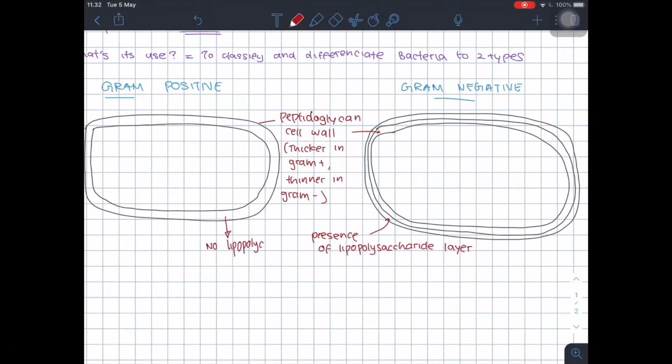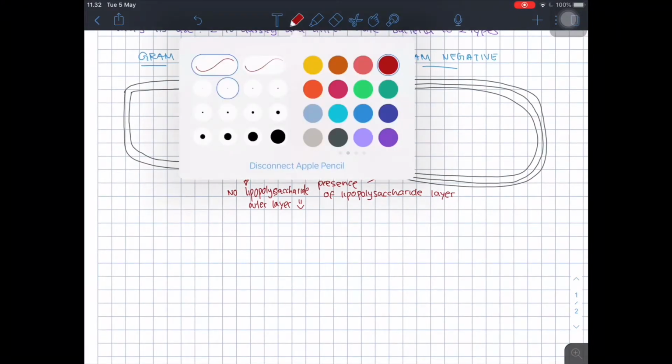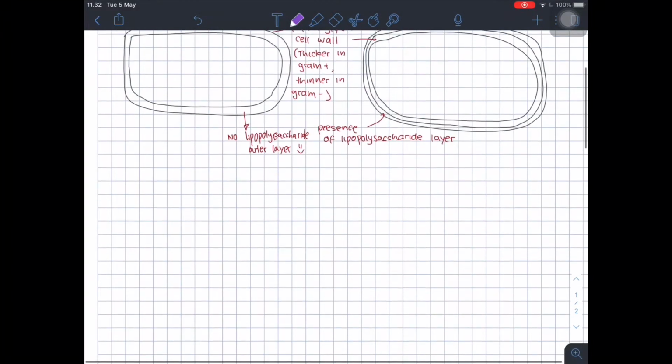The process of gram staining starts with using aseptic techniques to ensure that the experiment is sterile and non-contaminated. The first step is using an inoculating loop to smear bacteria on the center of the slide. Then, heat fix by passing the slide through a Bunsen burner.